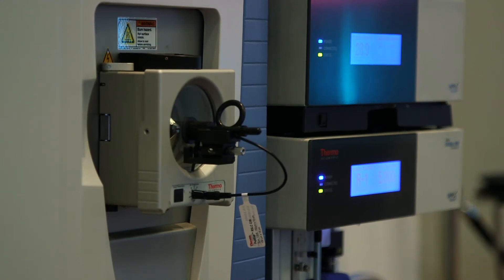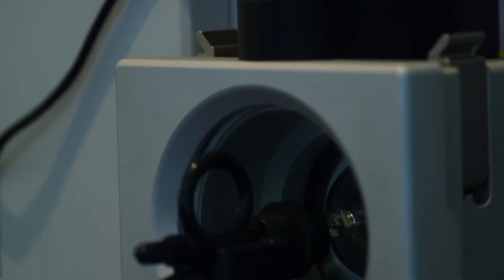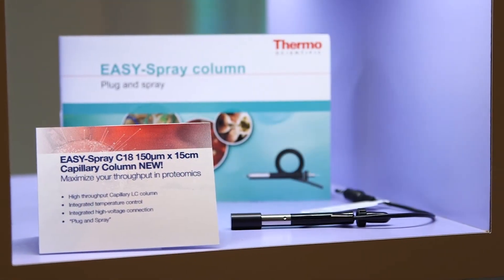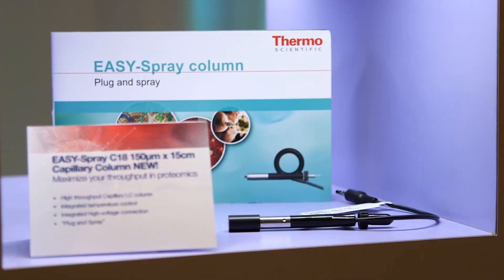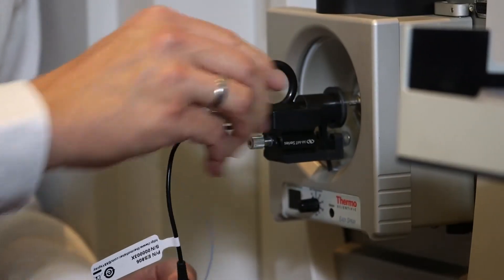Easy Spray format has been around for a while now and it's a very simple and easy to use format for putting low flow columns onto mass spectrometers, taking away a lot of the technical difficulty. The Easy Spray column has an integrated heater for constant temperature control, zero dead volume union so we don't reduce any chromatographic performance, and a precision glass emitter to give a stable spray. When you attach it to the source in a simple one-click method, you're up to speed and ready to go.